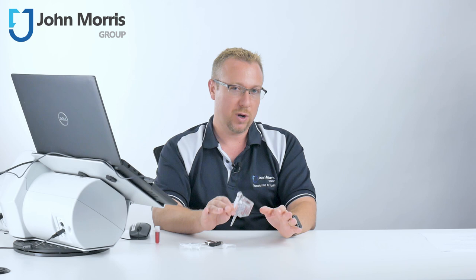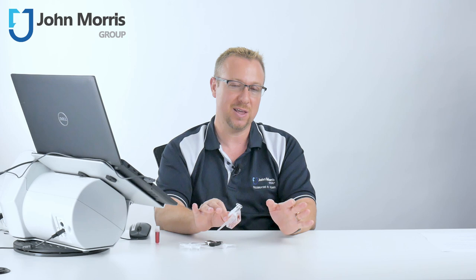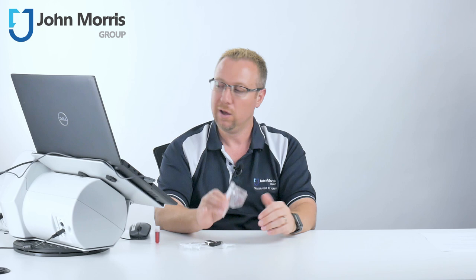So if your laboratory is looking for a GMP 21 CFR Part 11 compliant mammalian cell counter that has none of the issues associated with manual cell counting, or pipetting, or dyes, or staining, we'd really like to encourage you to have a look at the NC200 from Chemimetic.